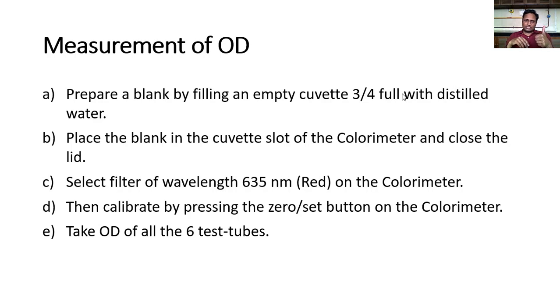Take cuvette with distilled water, place in cuvette slot, close the lid. Otherwise, the light from outside will interfere with the optical density or zeroing of the colorimeter. Select filter of wavelength 635 nanometer on the colorimeter and then calibrate by pressing the zero or set button on the colorimeter. This will set your colorimeter to zero absorbance and 100% transmittance. After that, take optical densities of all six test tubes.